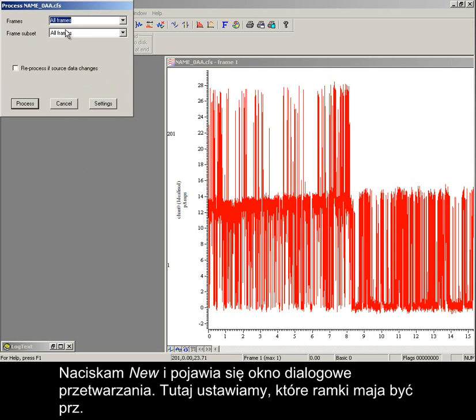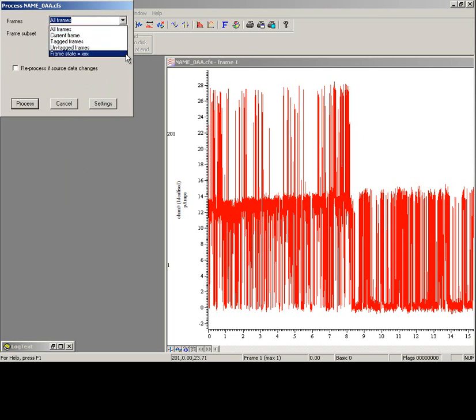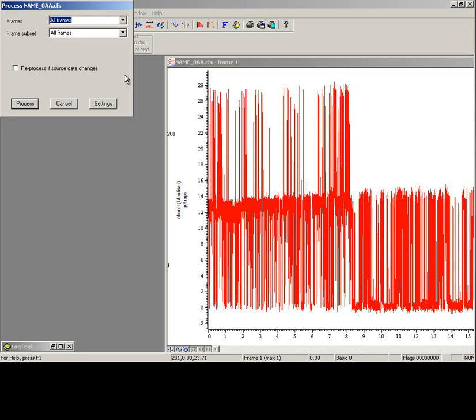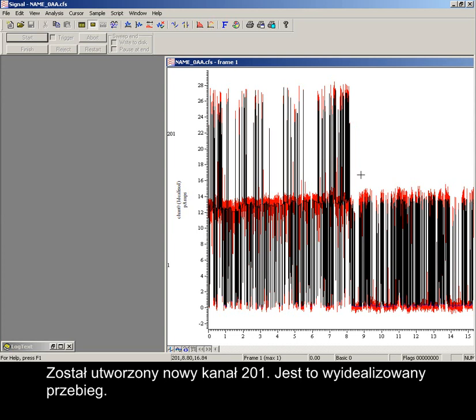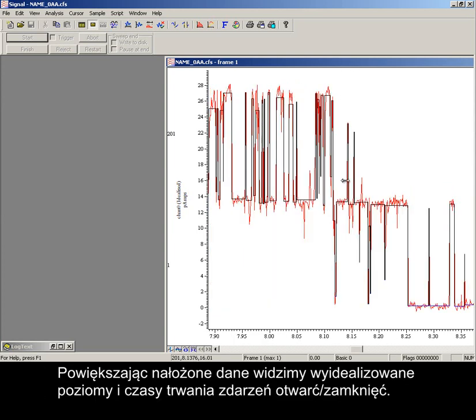Here we set which frames to process. Press Process, and all frames are included in the result. A new channel, labeled 201, has been produced. This is the idealized trace. Zooming into the overdrawn data, we see the idealized levels and durations of the open-closed events.